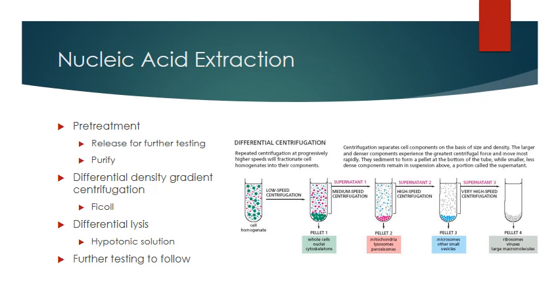Normally, if you just do a buffy coat where you highly spin the cells, first of all, you can damage the cells, but your white blood cell layer can be very, very thin. So you add that Ficoll layer so that basically you're thickening that white blood cell layer. Now you're not necessarily interested in getting every single last white blood cell, but you want just white blood cells. And so that's where this procedure will allow you to remove those white cells with the Ficoll.